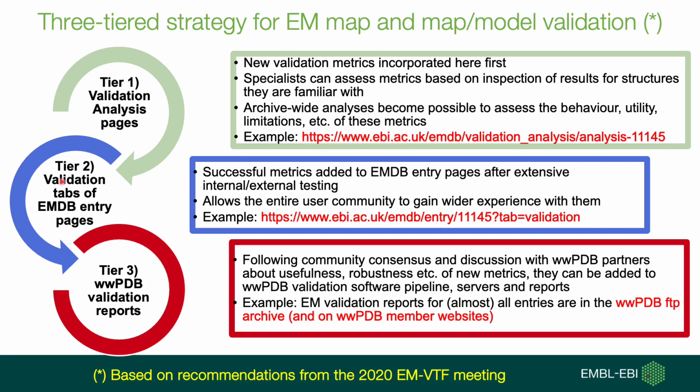Then on the EMDB website we have the validation tabs, and they contain a subset of the metrics and plots, etc. from the validation analysis pages. These are usually things that are tried and tested and reasonably well understood. And finally in tier 3, after a while, when there's consensus in the community and among the wwPDB partners, things can be moved into the validation pipeline that wwPDB uses to validate EMDB maps and PDB models.